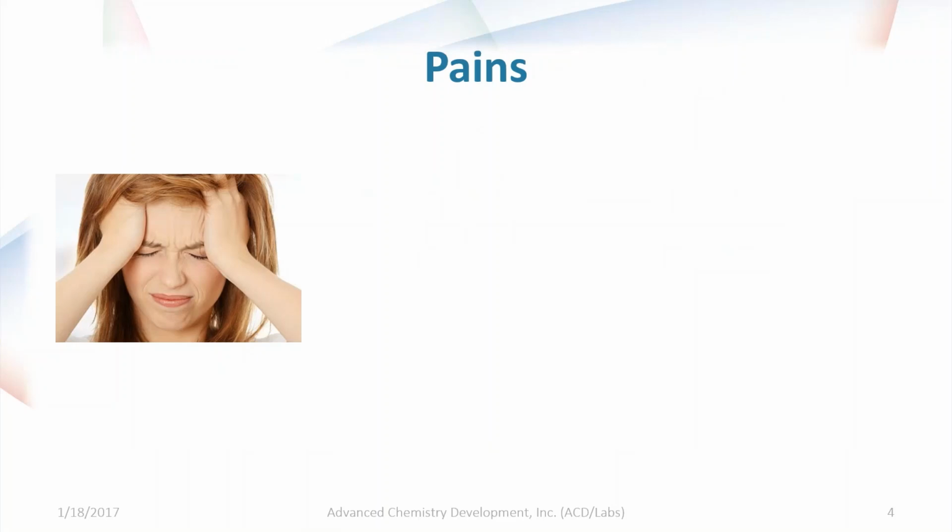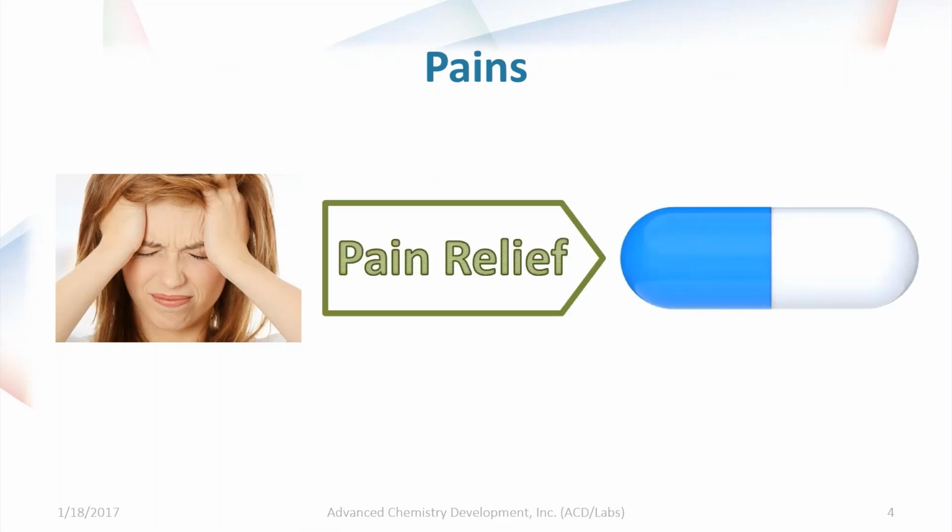So just to introduce the whole idea of method development, we understand that there quite often are many pains associated with working in the laboratory, and this is how people working on the day-to-day grind often feel: how can I go about solving my problems in as pain-free a method as possible? Our goal for this webinar is to show some of the tools that are available out there, both on the web as well as paid software. And so we want to draw your attention to all of these different ideas that could help you with your pain relief.